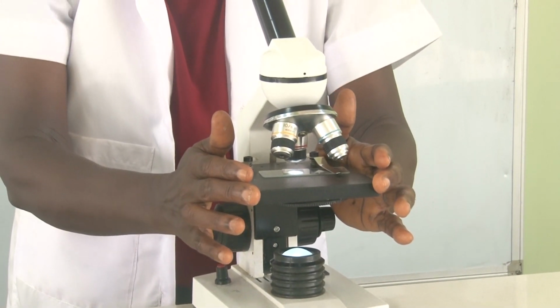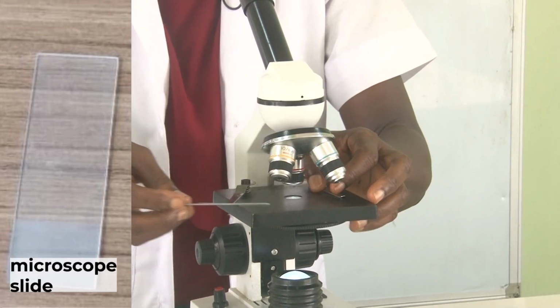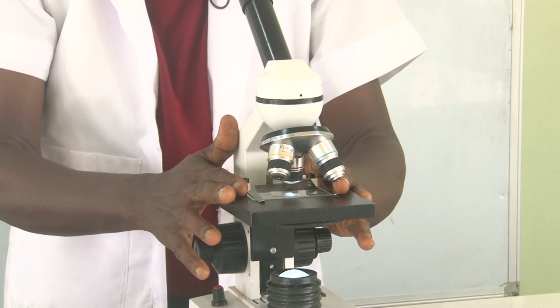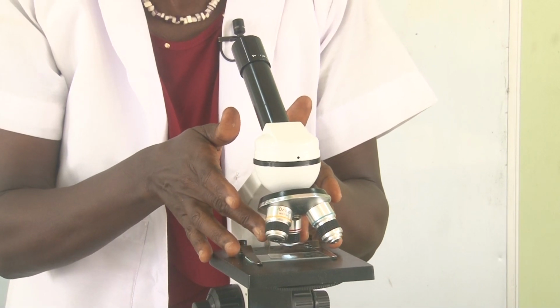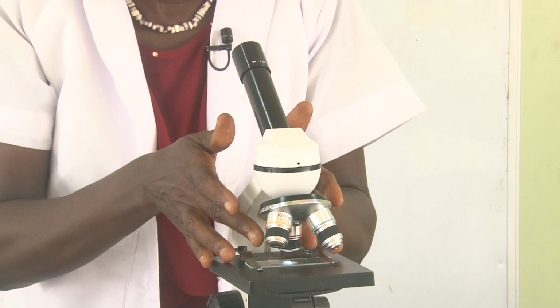We have the stage. We have our specimen slide that is put on the stage. We have these clips that hold the specimen slide in place. We have objective lenses, lenses that are very close to the specimen. They are convex lenses that magnify the image.